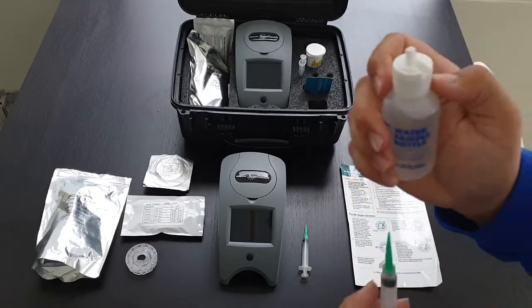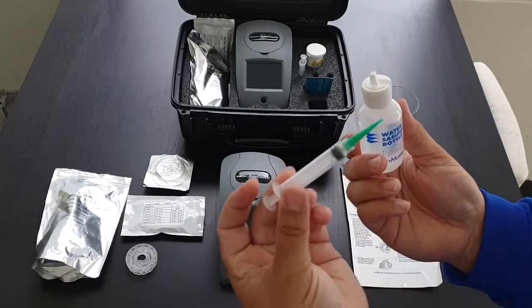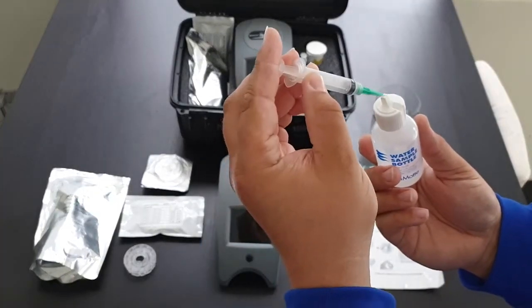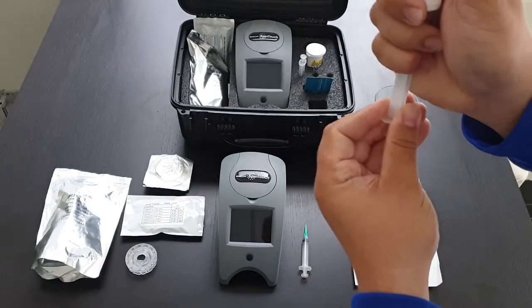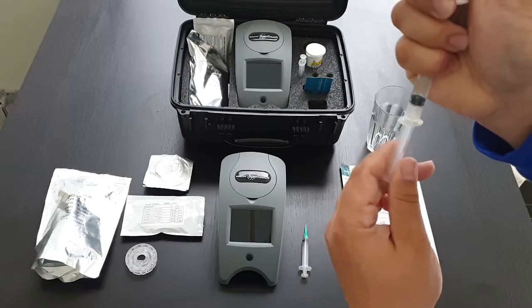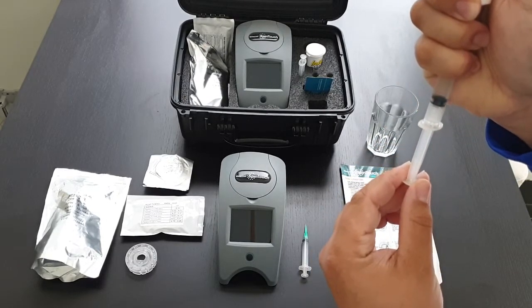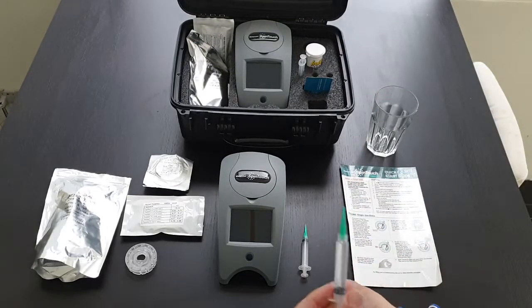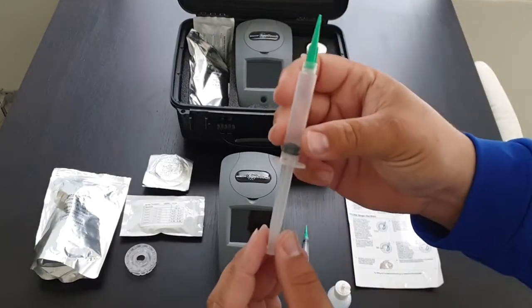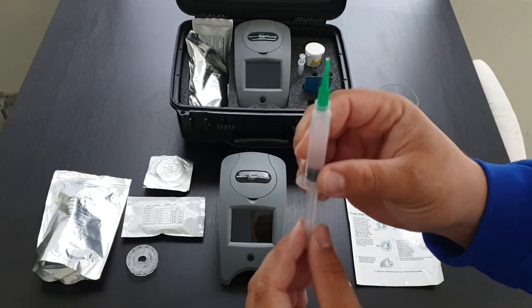There are a few ways you can get your sample. The most common is to open the lid, get your sample syringe, and just fill it that way. You want to make sure the whole syringe is full of water and there's no air in it.